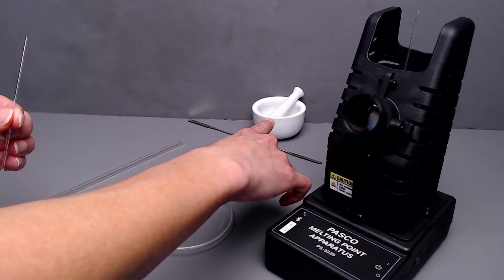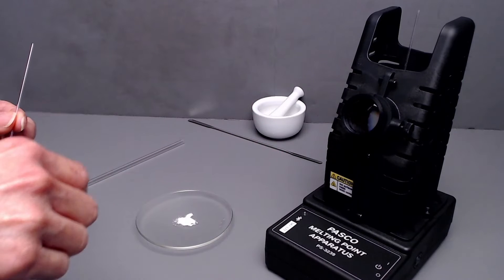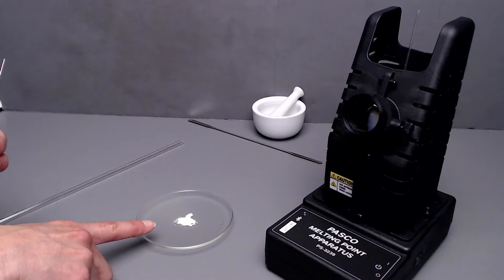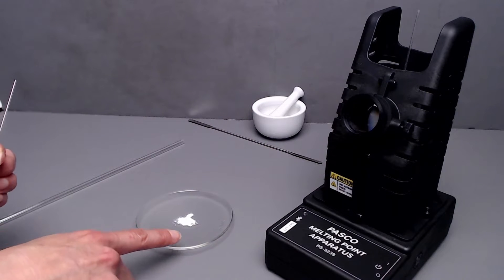First take your sample and grind it to a fine powder with a mortar and pestle. Then transfer the fine powder to either a watch glass or a filter paper.